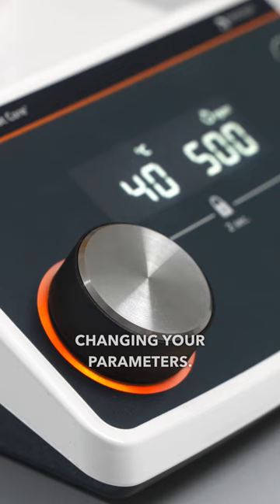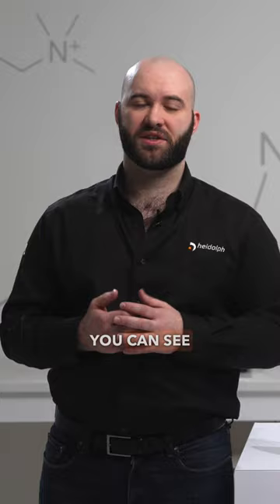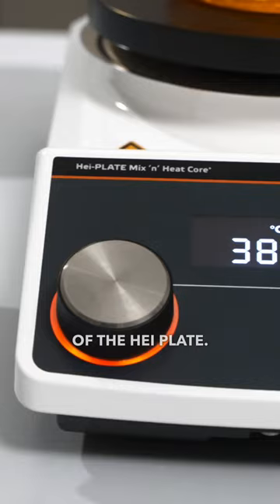Both buttons have illuminations below them, so from afar you can see whether or not your hot plate is heating or mixing. The hot plate core plus continues to use the PT-1000, thanks to the digital nature of the hot plate, so from your screen you can see what your process temperature is.